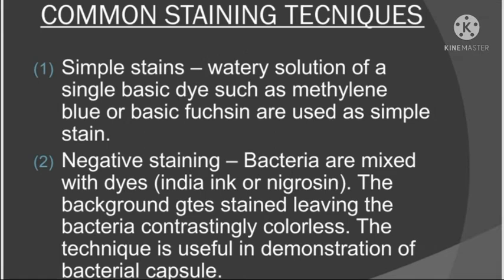Common staining techniques. First one is simple stain. A watery solution of a single basic dye such as methylene blue is used as a simple stain.